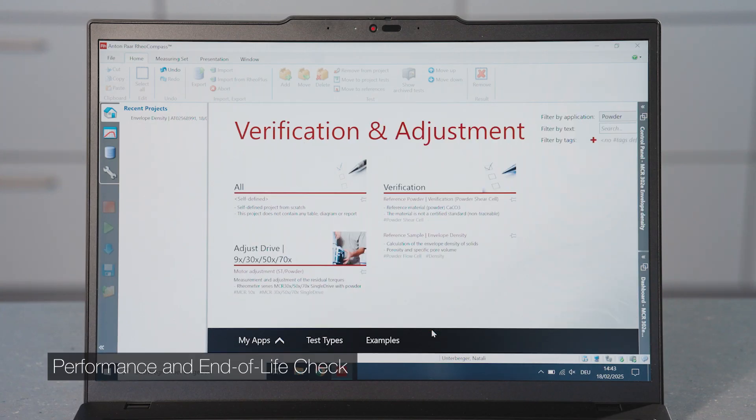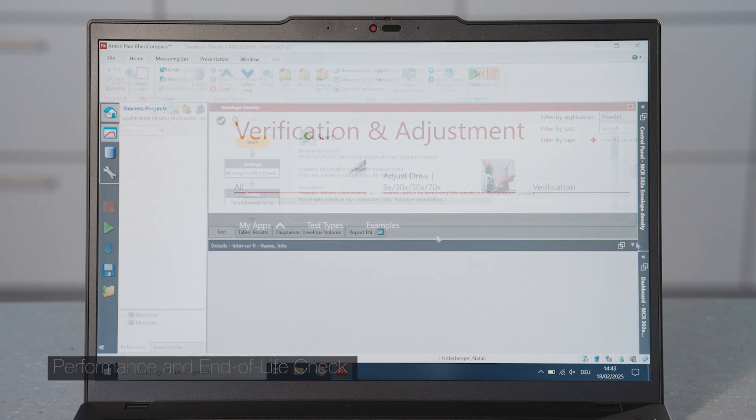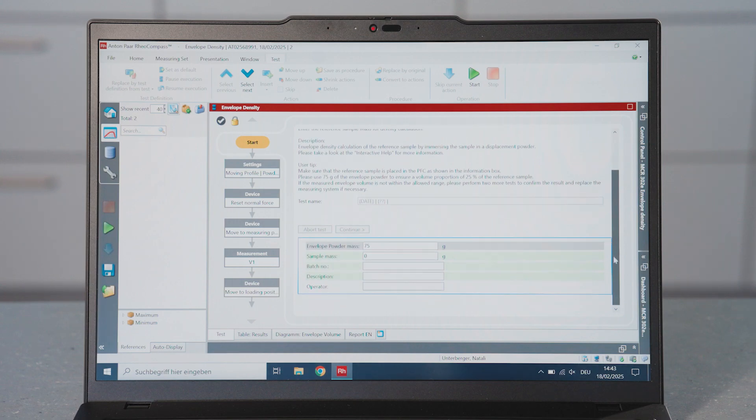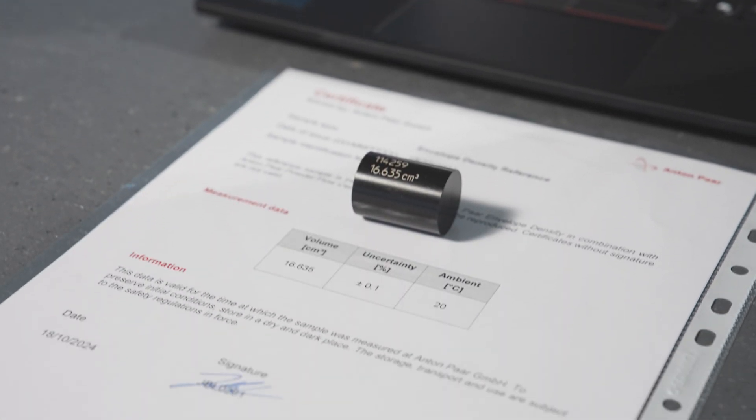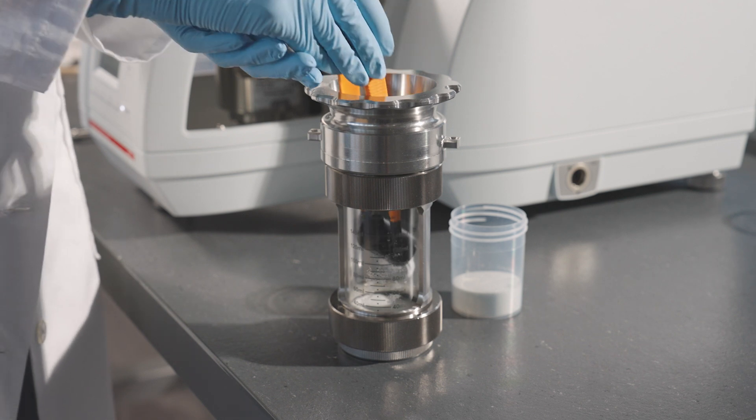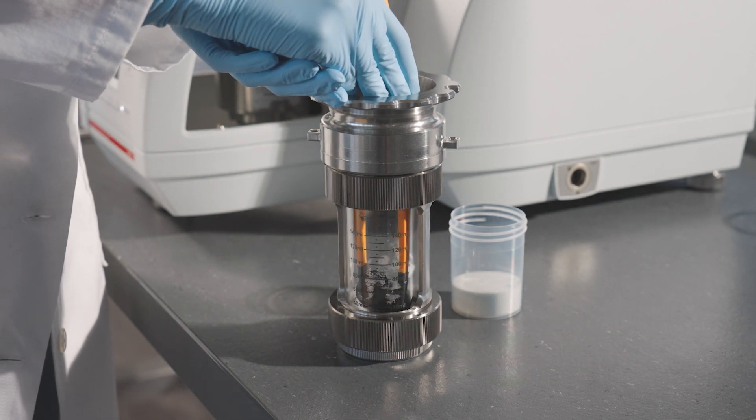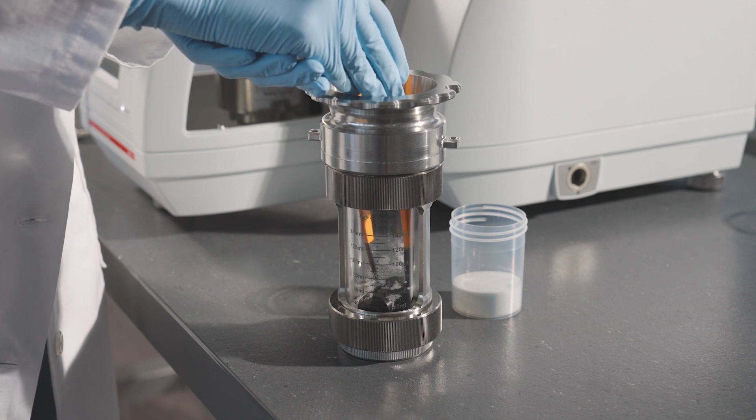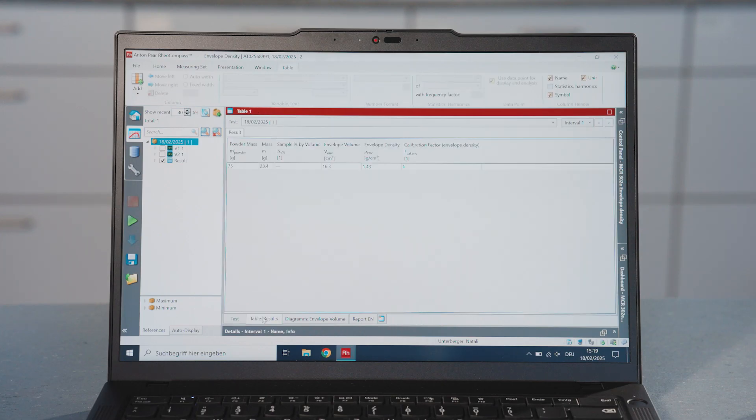Carry out a performance check by using the test template reference sample envelope density. Use 75 grams of the envelope powder to measure the supplied reference sample. Load the reference sample as instructed. Check the results in the results diagram of the measurement report.